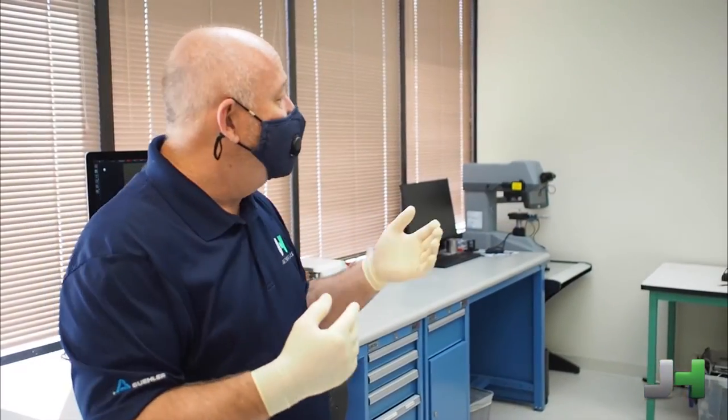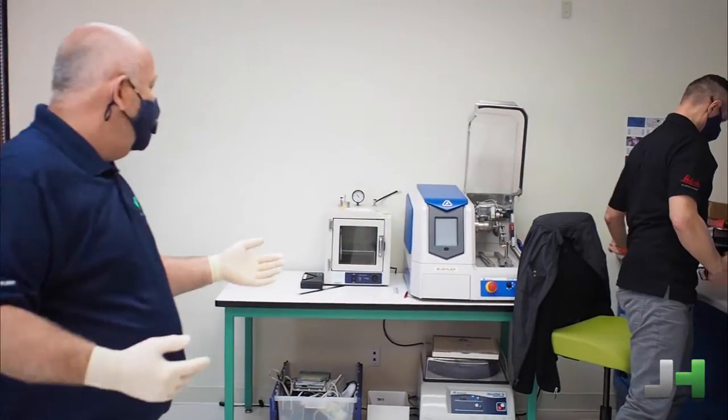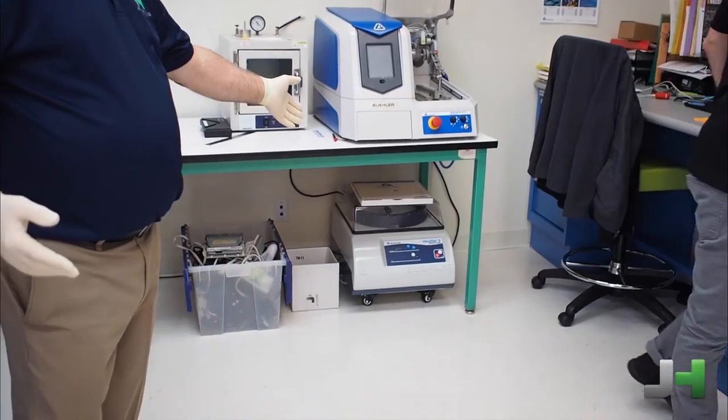So in our wet lab, we do have a Buehler saw. We have a Vibramet prep polisher.